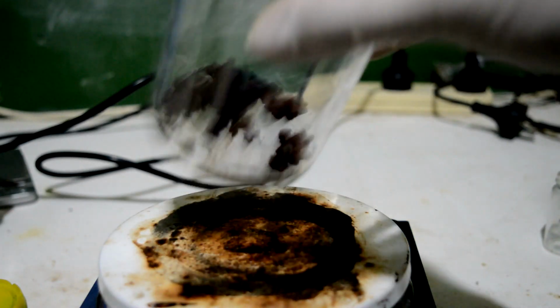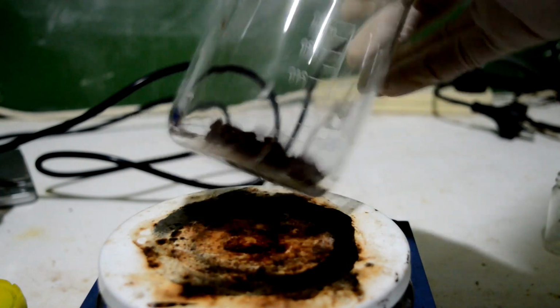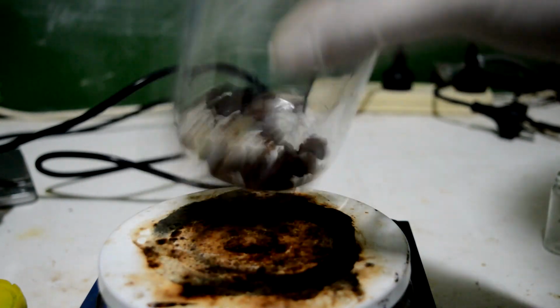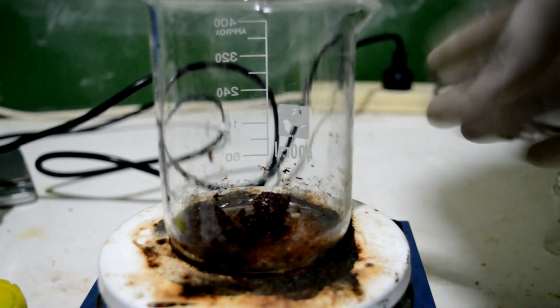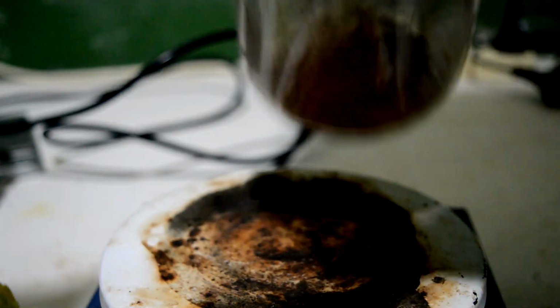Alright, as I suspected, there really wasn't that much in that solution, and it took over 4 hours to filter. Probably just on 4 hours. I'm just going to heat it on the hot plate to dry it out. Alright, that was pretty easy, pretty quick to dry it.